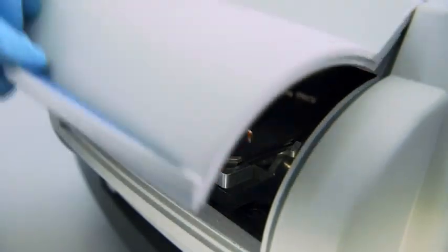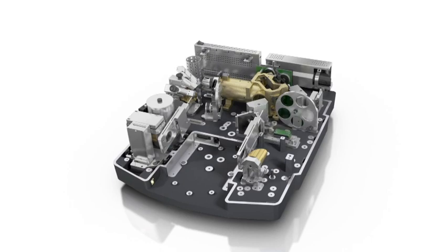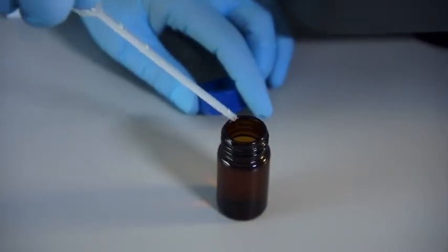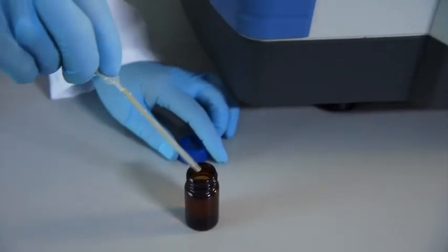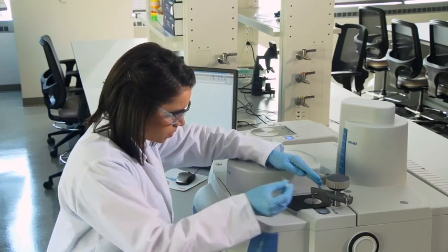Our exclusive touchpoint operation automatically coordinates beam splitters, detectors, and other infrared objects, so you can analyze street drugs, solids, and liquids with the press of a button, and quickly and seamlessly analyze pigments, paints, and plastics with mid to far infrared.